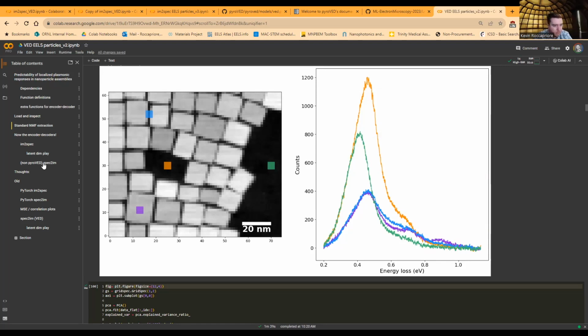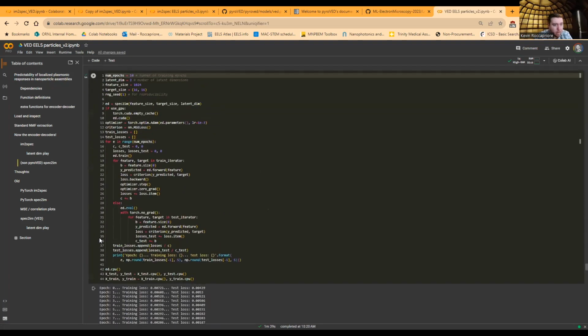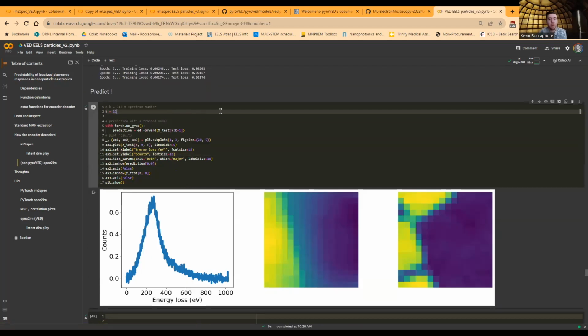So going back to the training, the training is done anyways, so we can then predict. I'll just repeat the same thing. You'll notice that there's no real shoulder in this case on this test spectrum, and so it noticed that maybe the intensity isn't as strong. So if we are further away from the particle, this peak will be weaker. So maybe that network realizes that there should be less and less of some sort of edge intensity here.